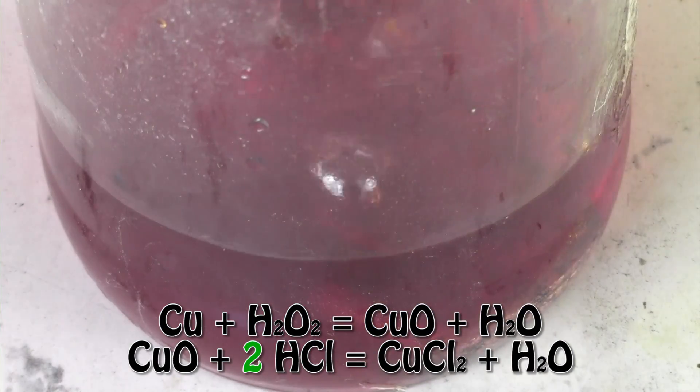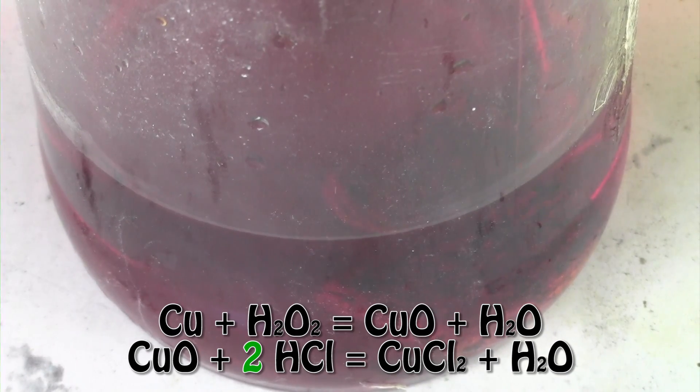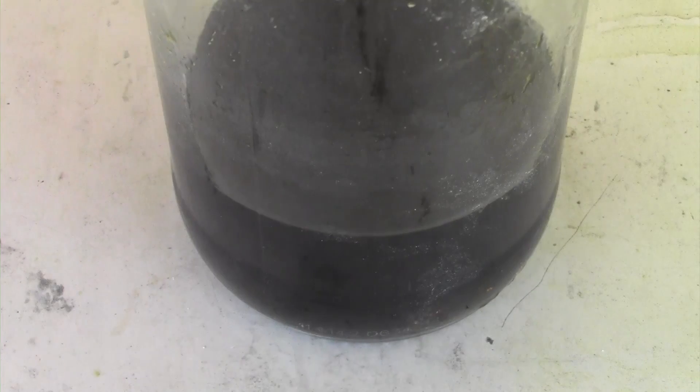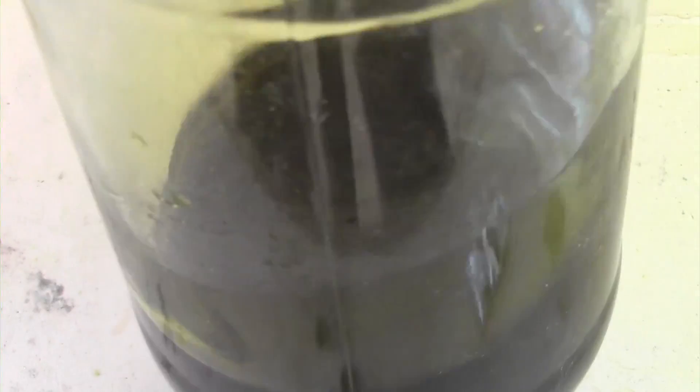The colour changes due to a stabiliser inside the hydrogen peroxide — I didn't know about this at the time I poured it in. Not all contain stabilisers; this one did to increase the shelf life of it, so look out for one that does not. After a day the colour went back to dark green, showing copper(II) chloride has been produced.